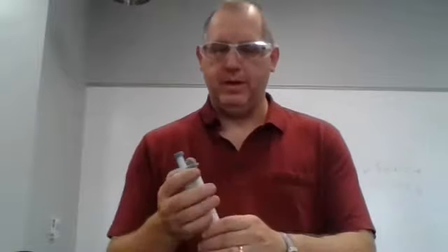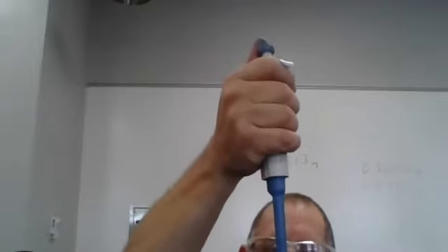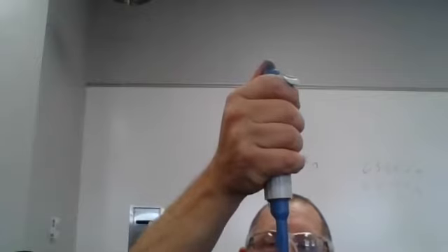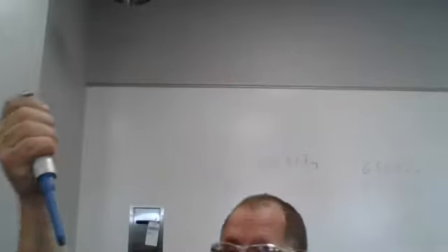Now again, this is not the best piece of equipment to use for this, but it's something that I have readily available that I don't have to clean up afterwards. So I am going to do this in the midst of this fun coronavirus quarantine. There we go. Just perfect. All right. Now, this is my 650 milligram or so. You probably can do some calculations.